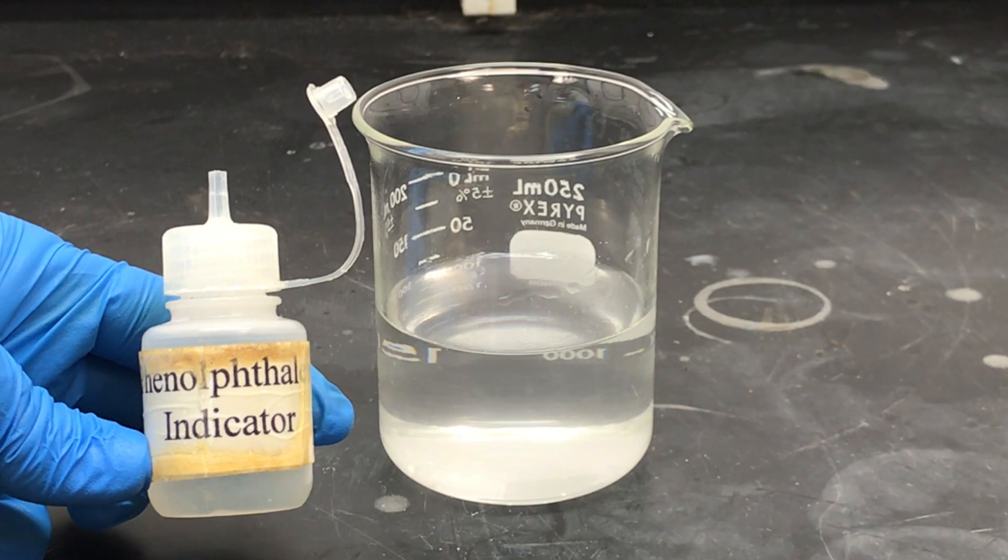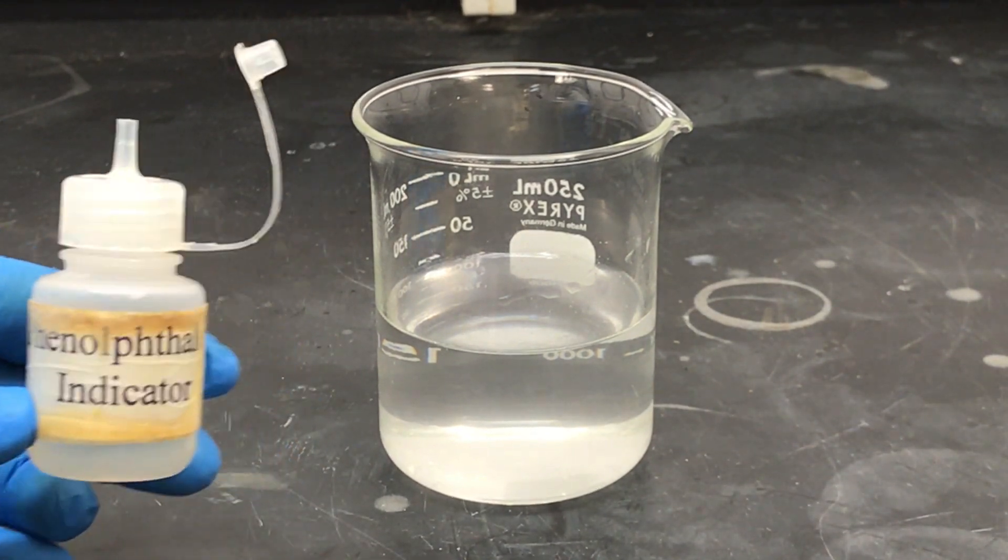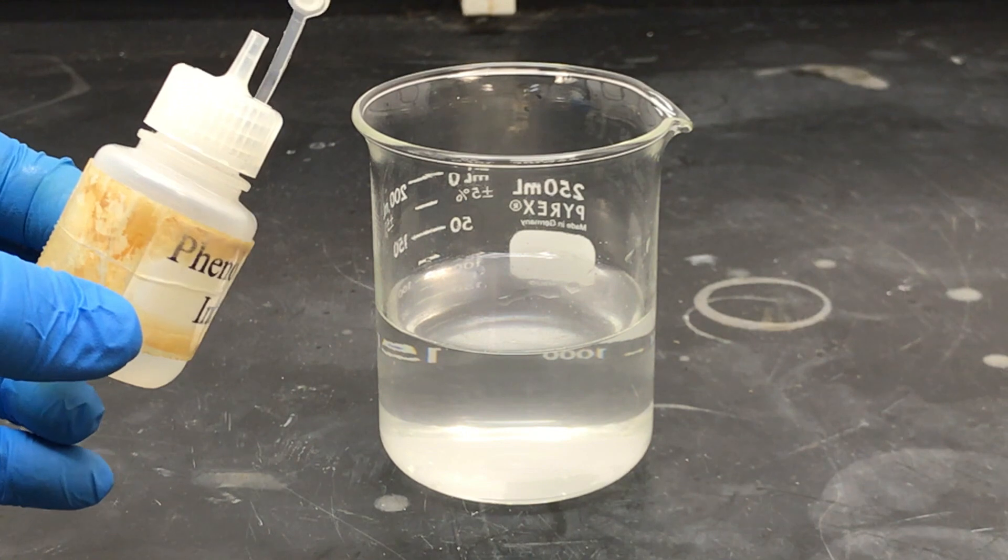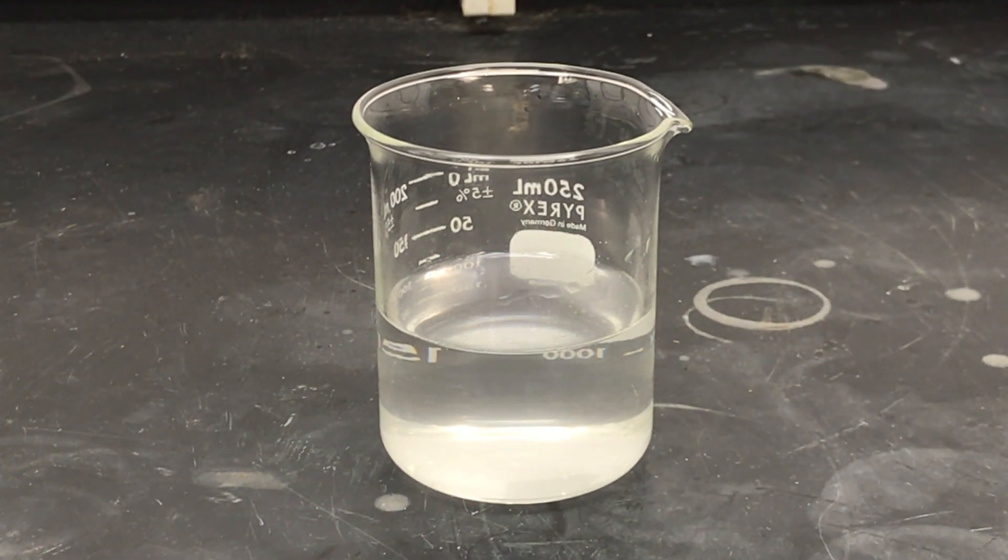In acidic or neutral conditions, the phenolphthalein solution is a clear colorless liquid. When the phenolphthalein comes in contact with a basic solution, it turns a lovely pink color.